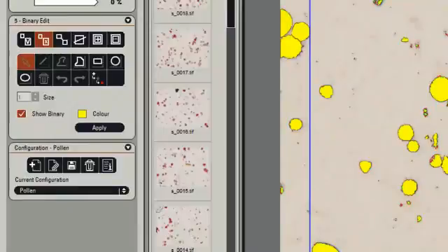It might be that there are some parts of this image that we actually don't want to measure, but which we're not able to let the computer identify automatically. So we can always interact with the image and override the computer's decision. In this case, I'm going to remove from the image a region where I believe particles that we can see we don't want to measure.